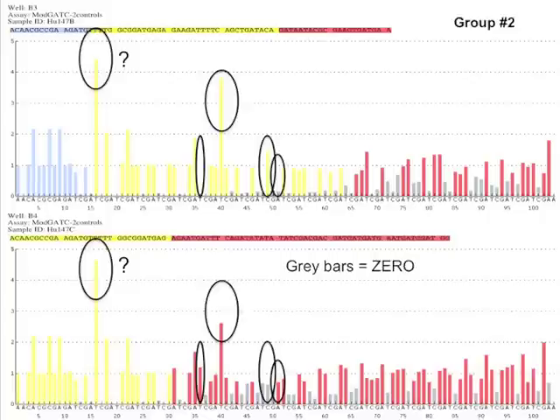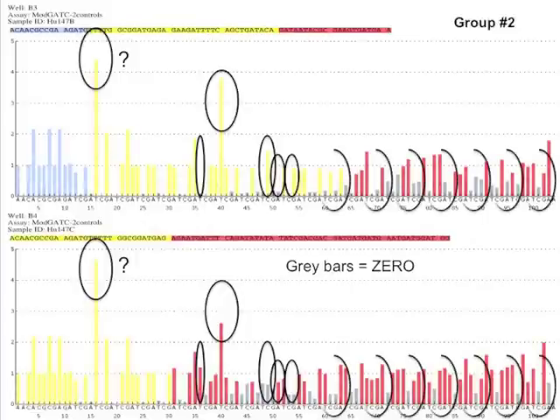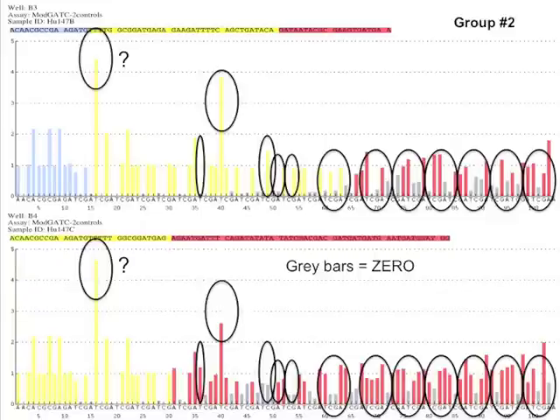If we continue down the line here, we'll notice that there continue to be differences in the number of nucleotides the machine recognized as being added to the extending strand. And if we progress outwards here, more and more of those differences appear until we finish out the entire dispensation order. And as you'll notice, there are quite a few more differences between these two pyroprints than there were between the first two pyroprints from group number 1.